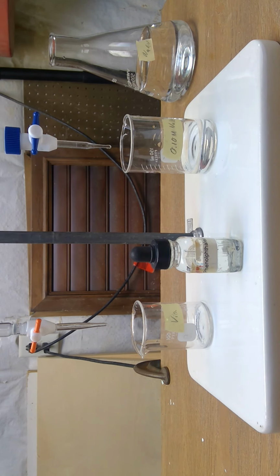So our initial burette reading for the NaOH is going to be 0.00 for our first trial, and our initial reading for the vinegar is going to be 30.00, and that's for trial 1.